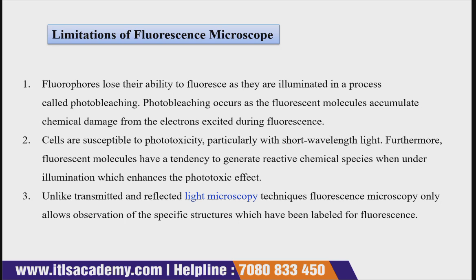Unlike transmitted and reflected light microscopy techniques, fluorescence microscopy only allows the observation of the specific structures which have been labeled for fluorescence.